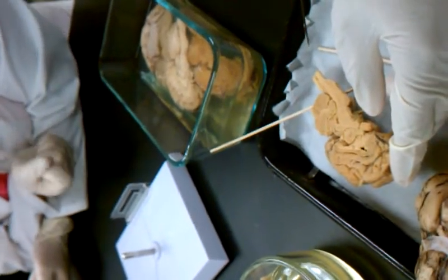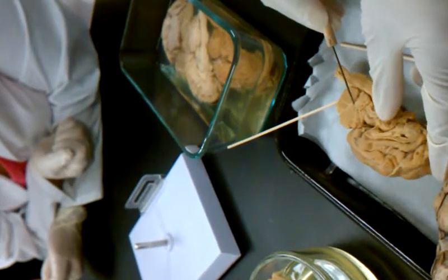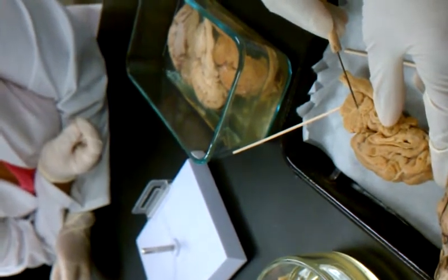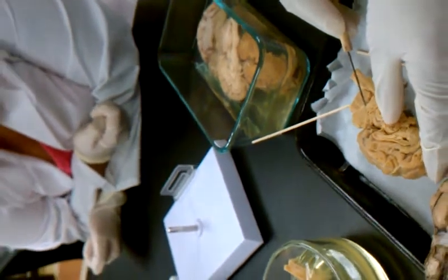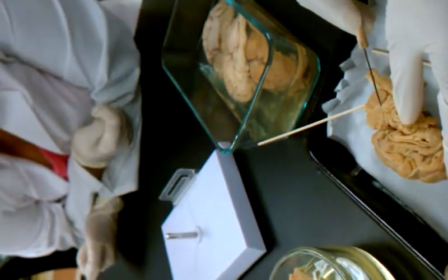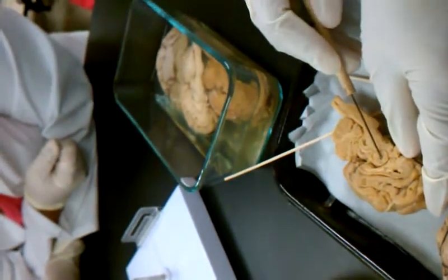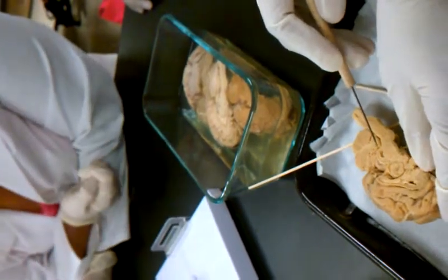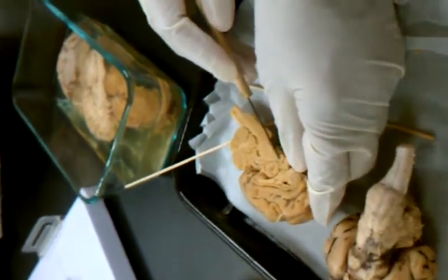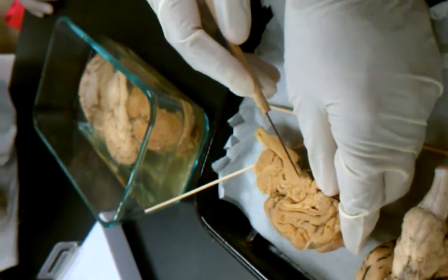And what is the arbor vitae? The tree-like structure. So, okay, we already went over the cerebral aqueduct. Thalamus is here. It's in the middle. And the hypothalamus is right underneath it. Just right below.